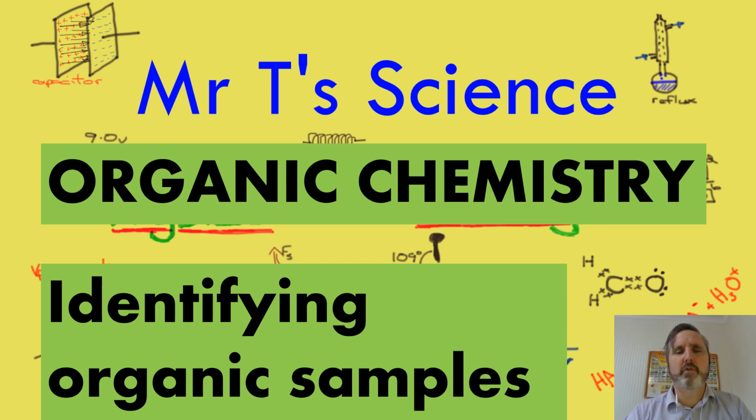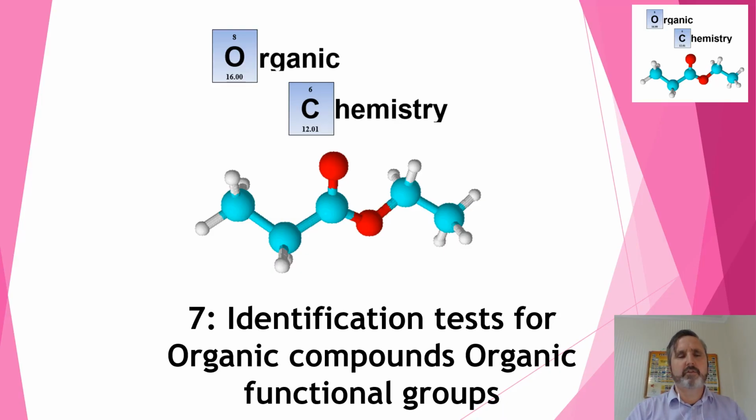Now, how often have you gone through your lab at your chemistry class just to come up with an epic fail? Well, today I've set up a video that can go through each one of these tests and see what should have happened when you did that experiment. Right, let's crack on and find out how to carry out these important identification tests.